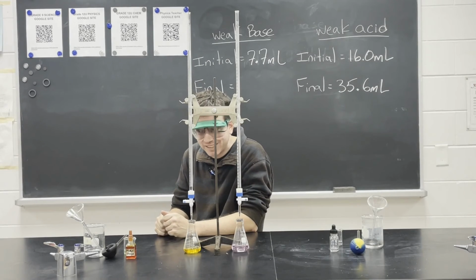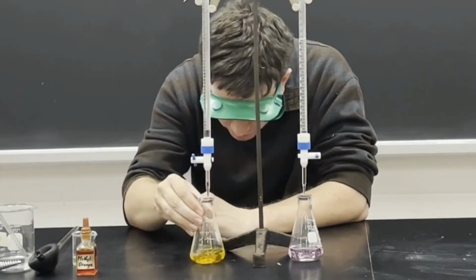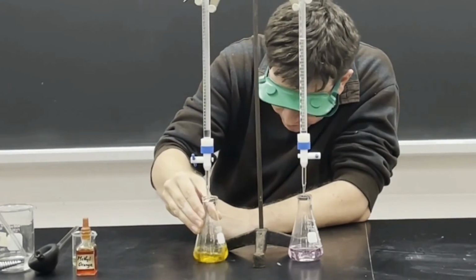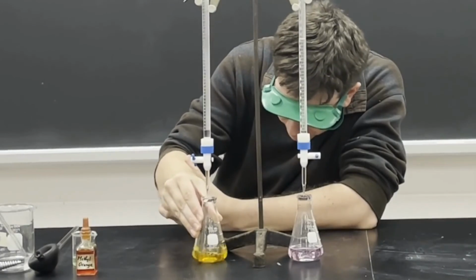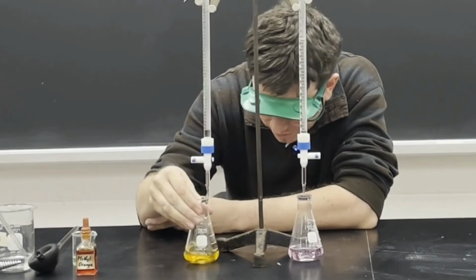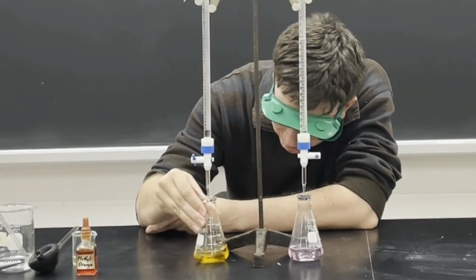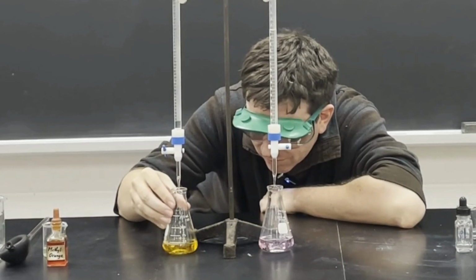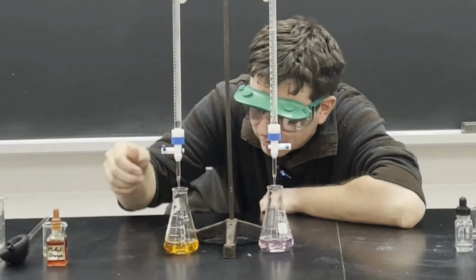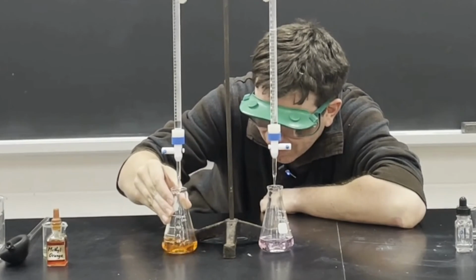Let's start our titration. There we are.